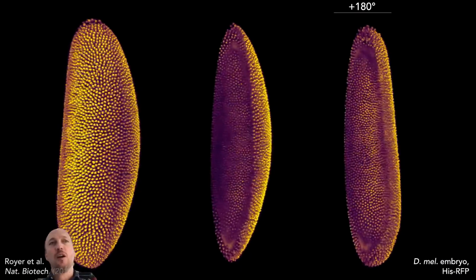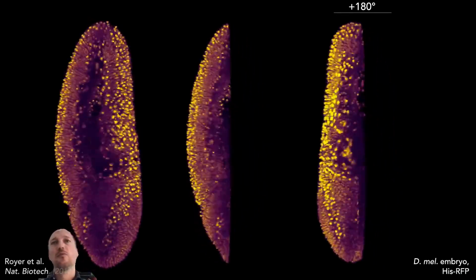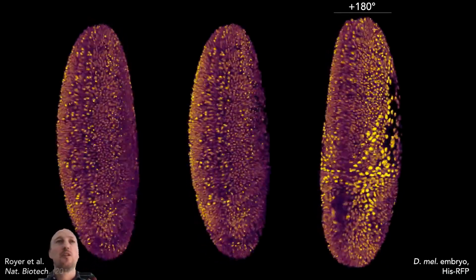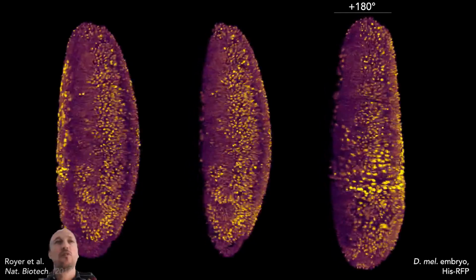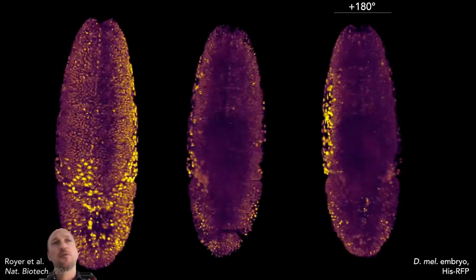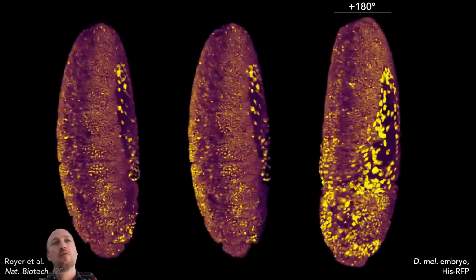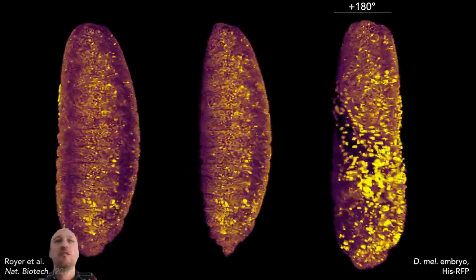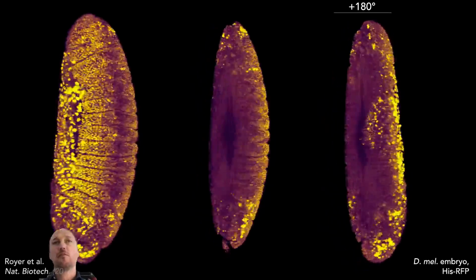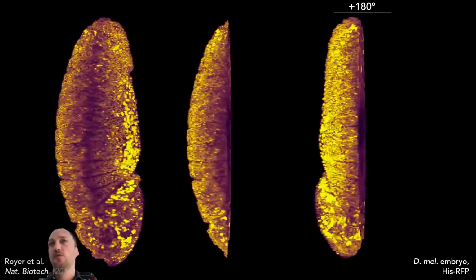So, the kind of data sets you can get from these instruments are beautiful data sets such as these. This is something I acquired together with the team of Philip Keller in Geneva. Very fantastic, beautiful data set, exquisite temporal and spatial resolution.